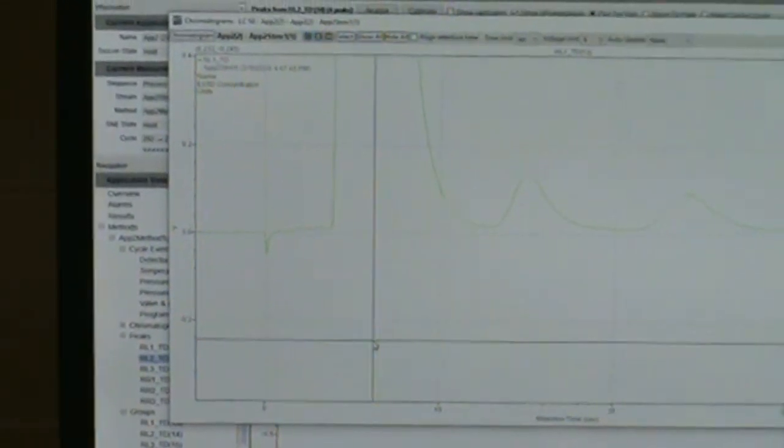At time -8, we are going to have sample shutoff valve, ARV, and we are going to vent to atmospheric pressure. At time 0, which is that guy right there, that is when we inject.